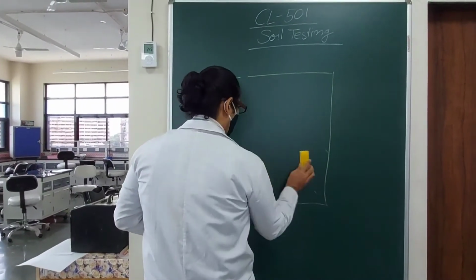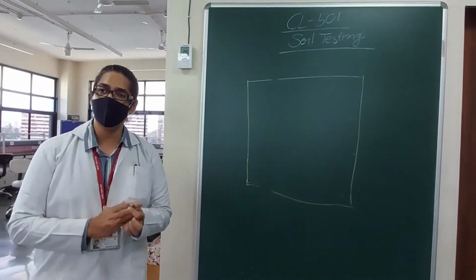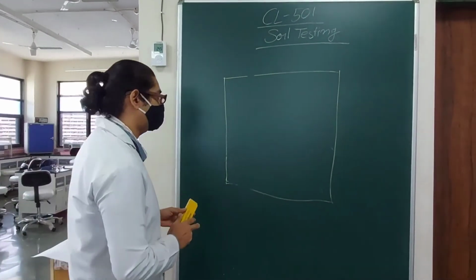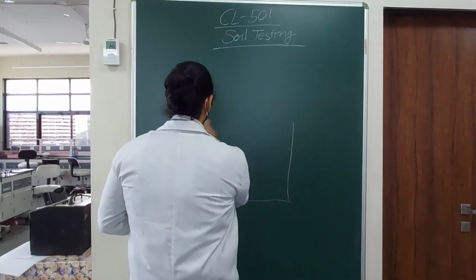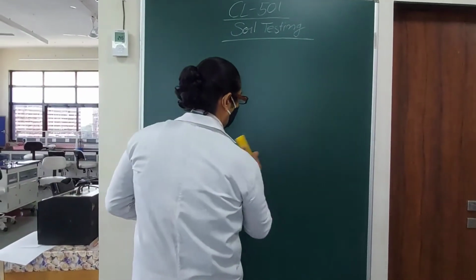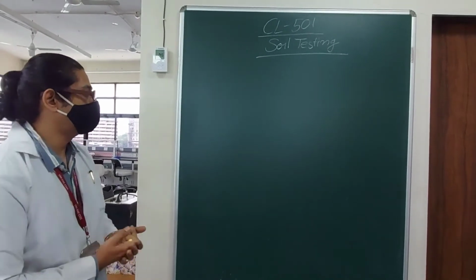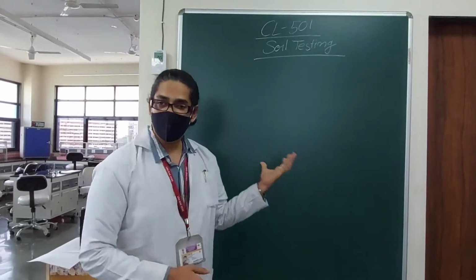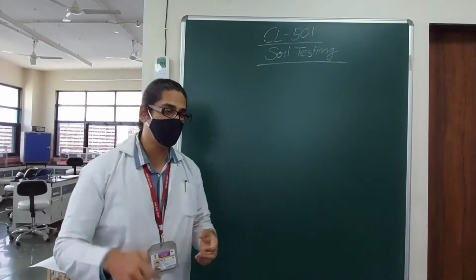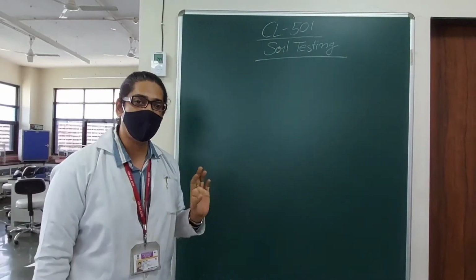And now what we have today is soils from 4 different locations, and we are going to measure the 4 parameters, as I said already. Using a pH meter, we are going to measure the pH, and we also have the universal indicator liquid to see if our pH meters are giving good values. Then with the conductivity meter, we are going to measure the conductivity, and moisture content. We'll show you how we measure it in the oven, and also we are going to measure the organic content.